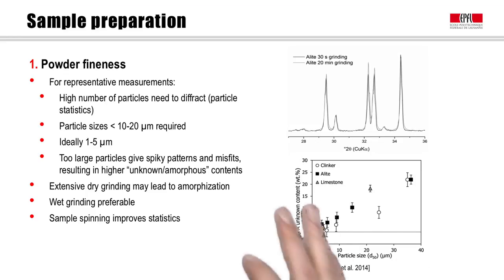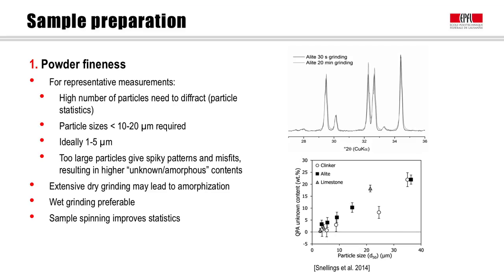In the graphs on the right side, you can see the effect of material fineness on the XRD patterns. On the upper right, you can see two XRD scans of the same material, a synthetic alite, ground for two different times. One was ground for 30 seconds, resulting in a rather coarse alite with a median grain size of about 36 micrometers. The other used a long grinding time of about 20 minutes, resulting in alite particles of about 3 micrometers. You can see that for the longer-ground sample, the peaks are a little broader and more regular mathematically. Having large particles gives a spiky pattern and results in misfits, which leads to larger apparent amounts of unknown or amorphous content.